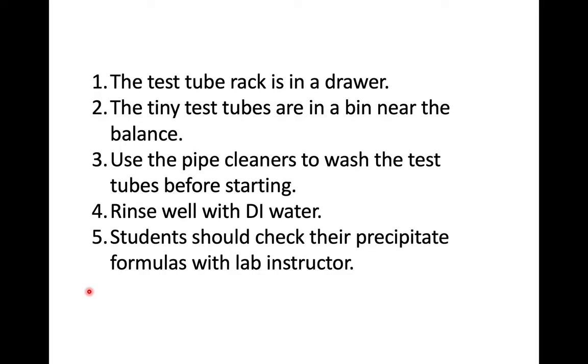Here's some more tips for the lab. The test tube rack will be in one of the drawers. The tiny test tubes that you'll need, however, will be in a bin near the balance. Use a pipe cleaner to thoroughly wash the test tubes. If you have traces of materials from previous experiments, it can really make this lab much more complicated. So you want to take your time, wash out the test tubes, and rinse them well with the deionized water.